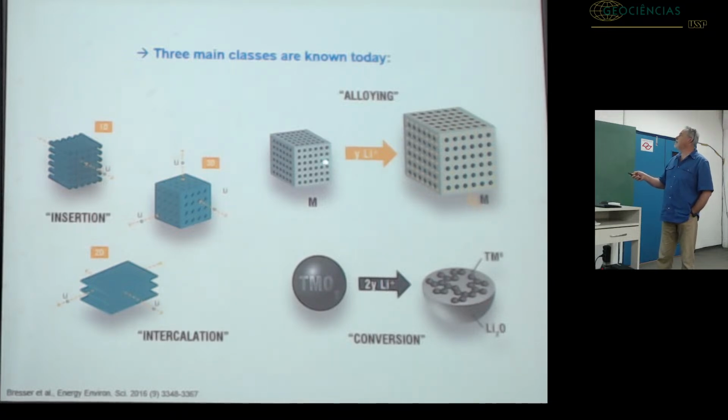In this case, the volume difference is very large. Or lithium can enter a structure, even zircon, which is a refractory material, can serve as an anode. Lithium can enter the zircon structure, completely amorphizing the structure, or even decomposing it to some component oxides, mostly amorphous.